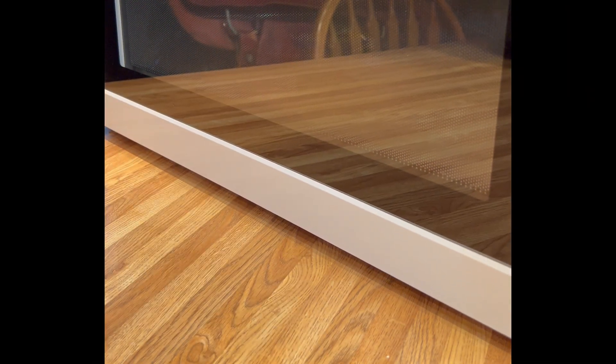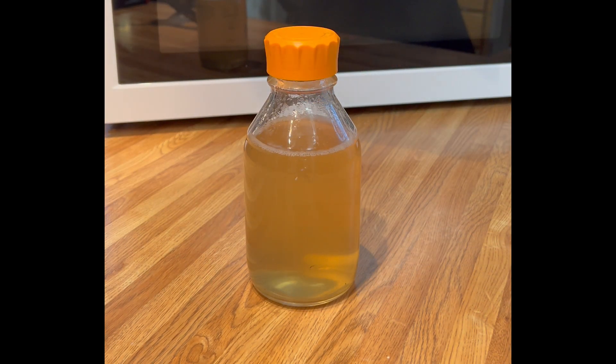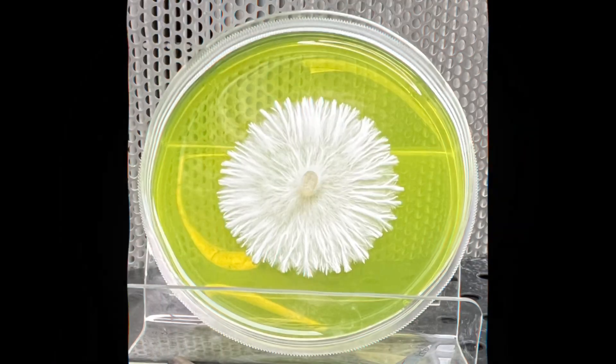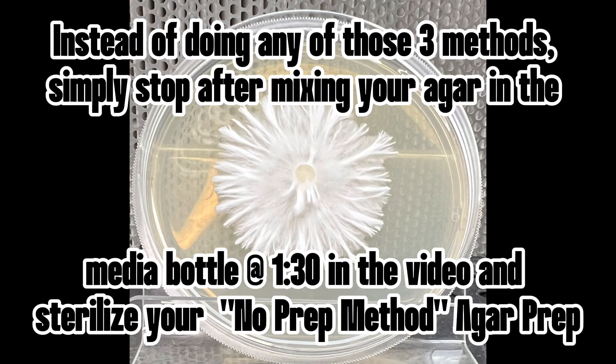We're going to let it boil up once, then stop the microwave, and boil it up twice for a 500ml batch. This helps with the mixing action and gets it extra hot, which actually takes a few minutes for the agar to fully gel into the solution. You'll see that after it's sat for a couple minutes it's nice and clear — that's how you get clear agar. Easy peasy. Much love, rock on.